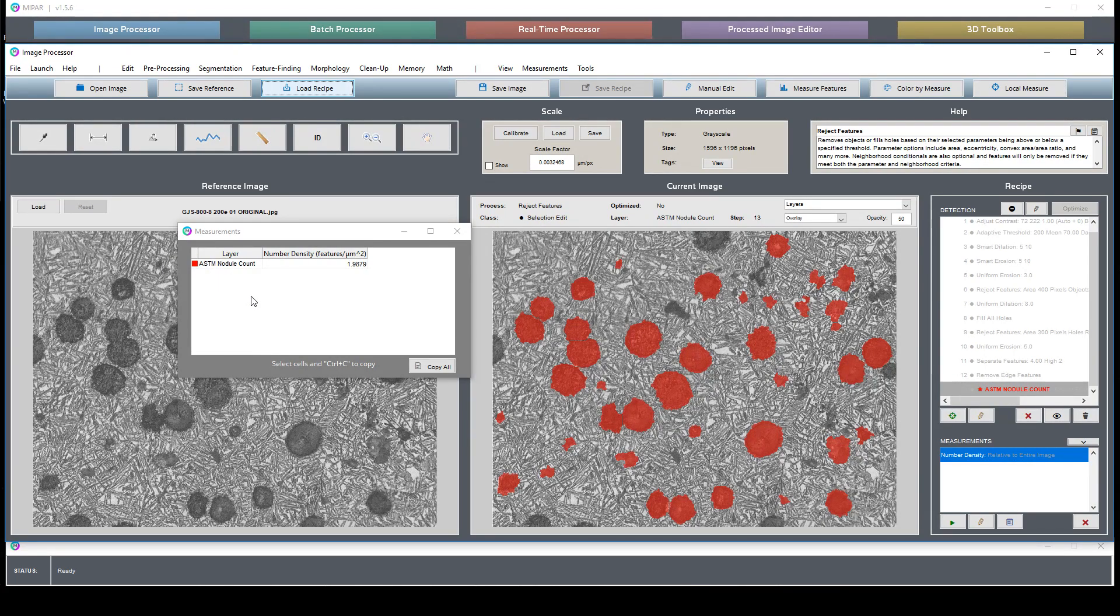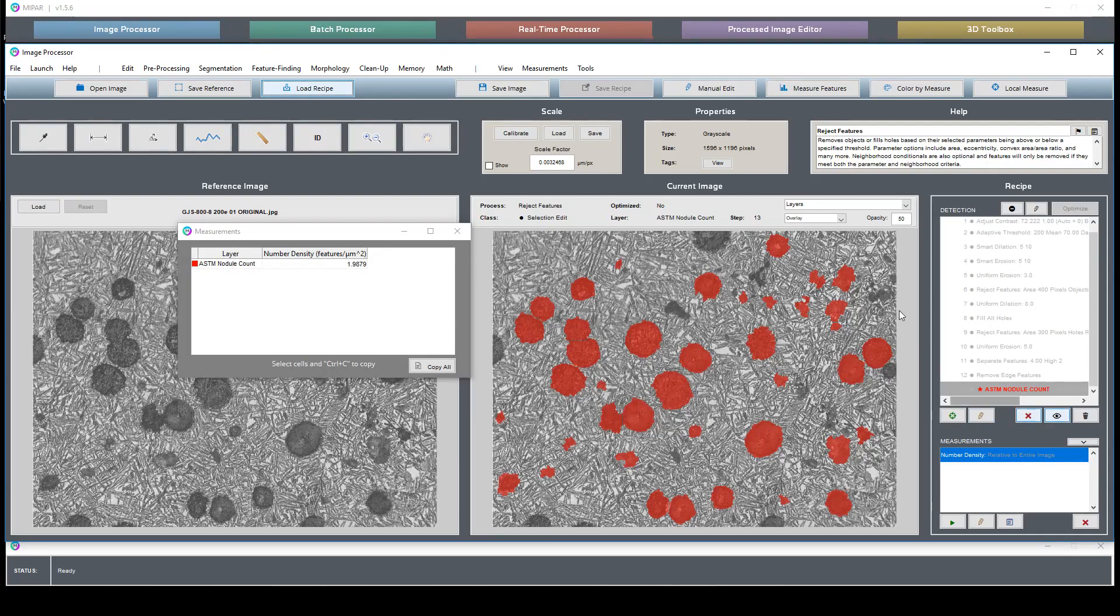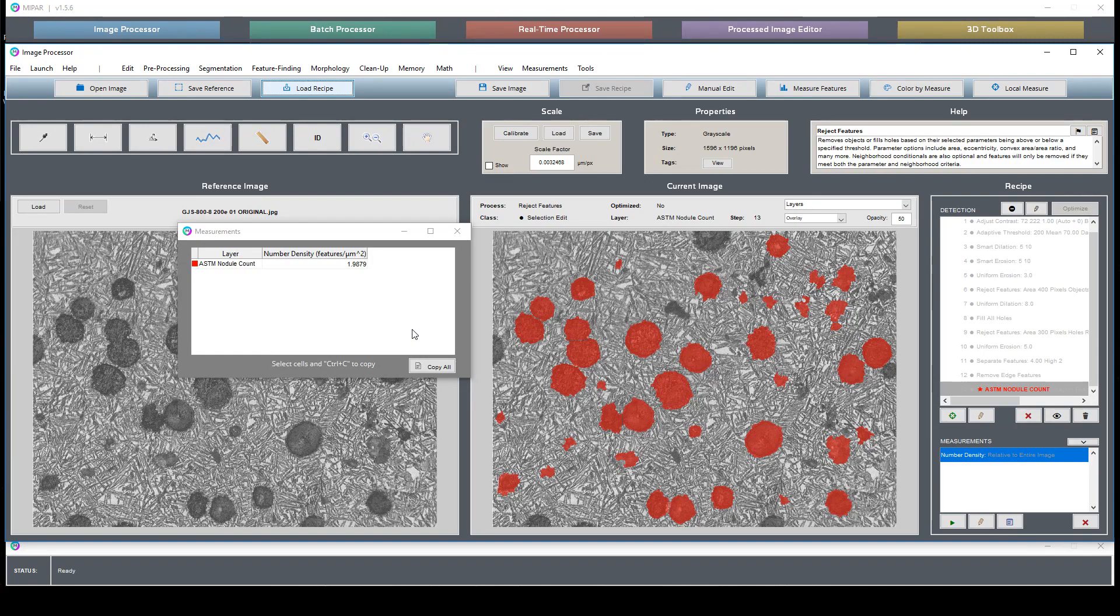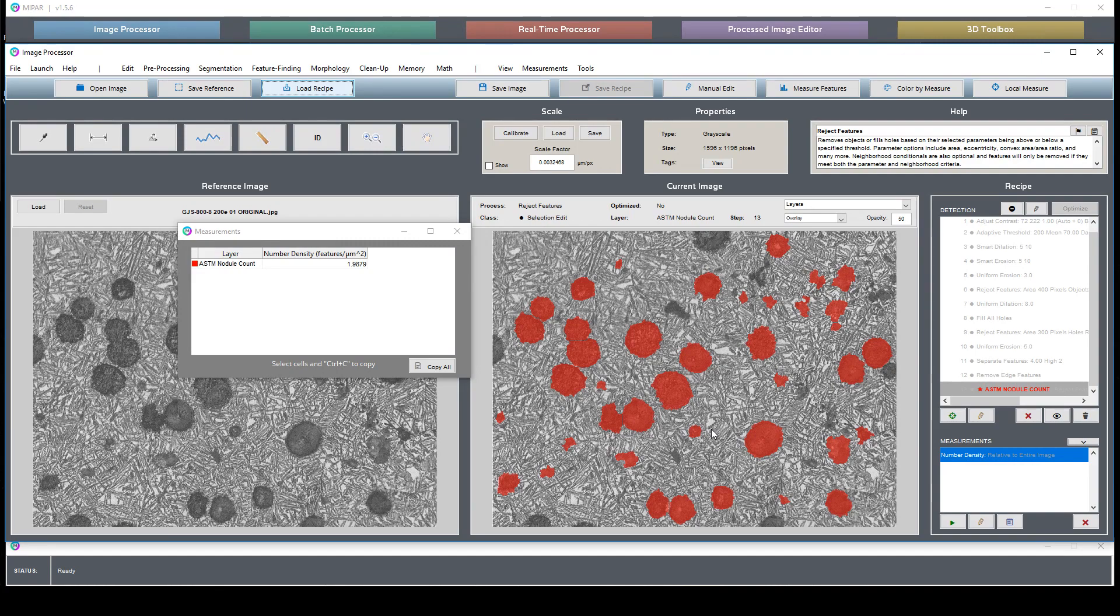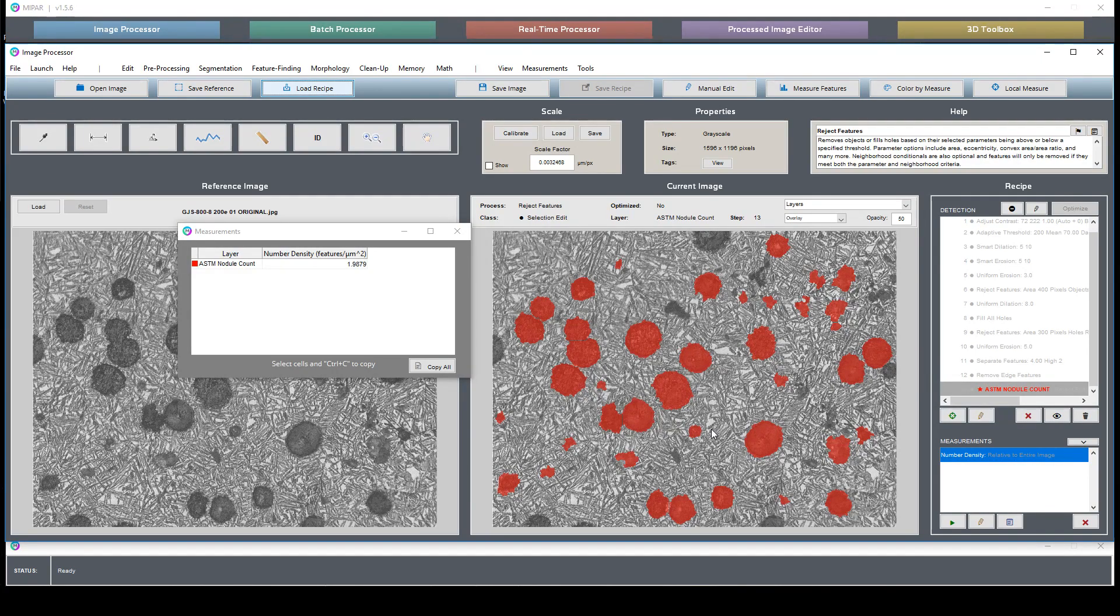What you can do is you can set up a single recipe that generates both of these measurements at the same time. I just decide to separate them just so users can find what they're looking for. So very similar recipe and all this reports is a number of nodules per micron squared.